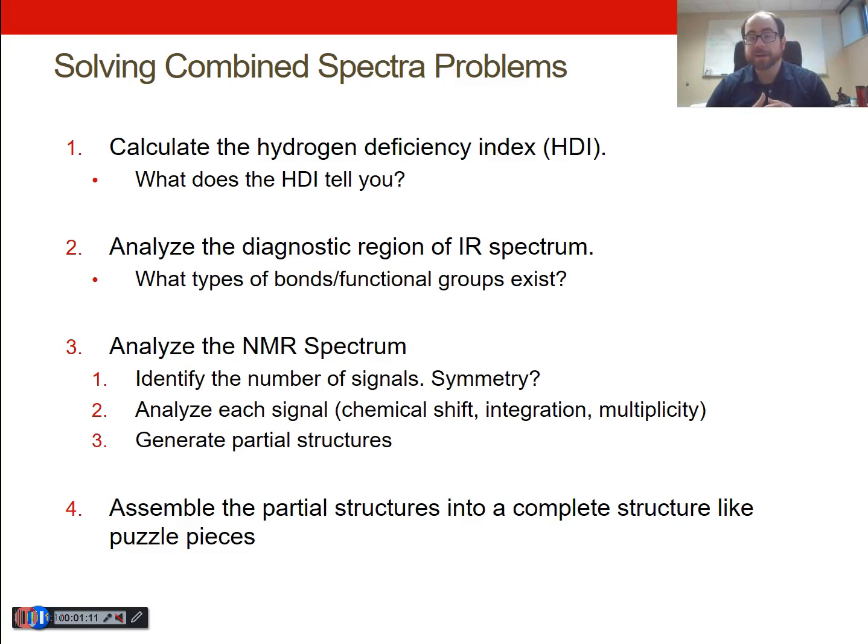Next, take a look at the IR spectrum and identify the various different types of bonds that exist. And from those types of bonds, I can piece together ultimately functional groups that could exist within the molecule.